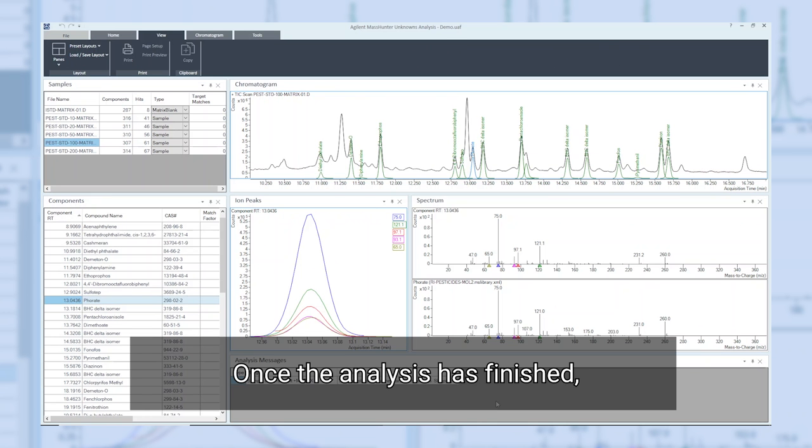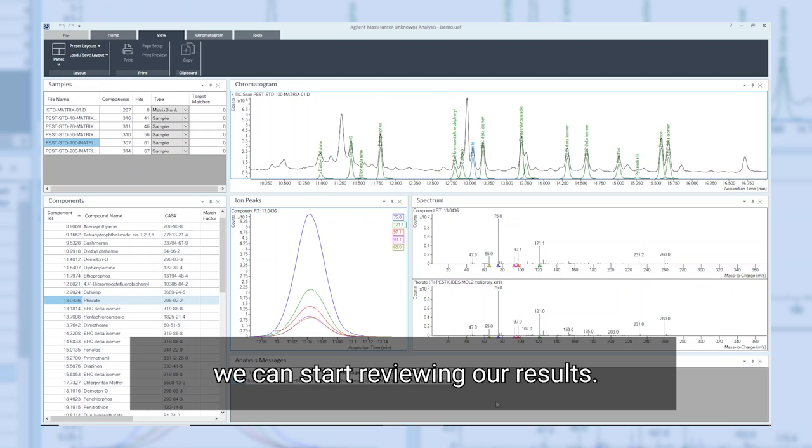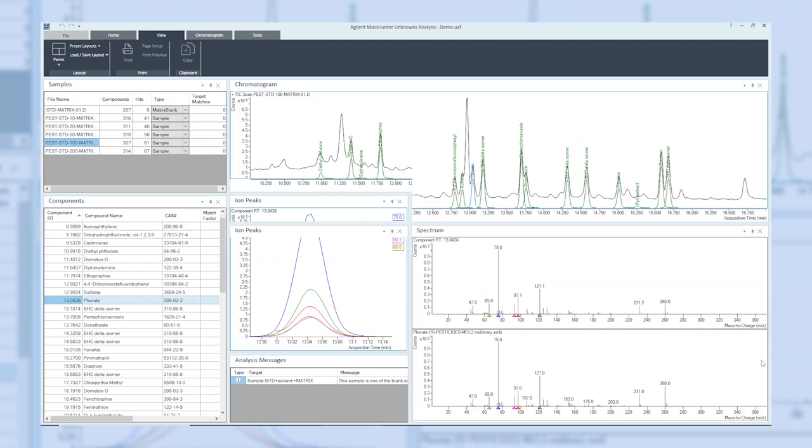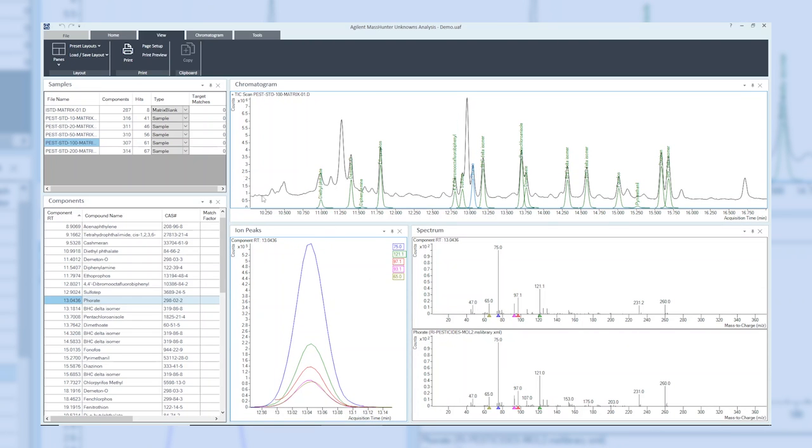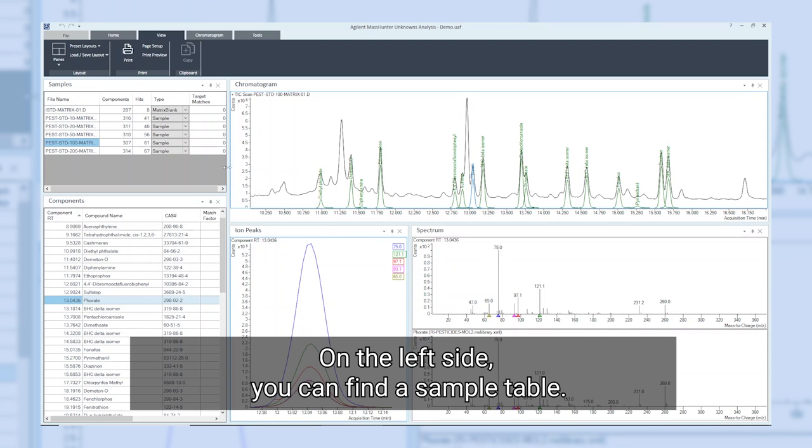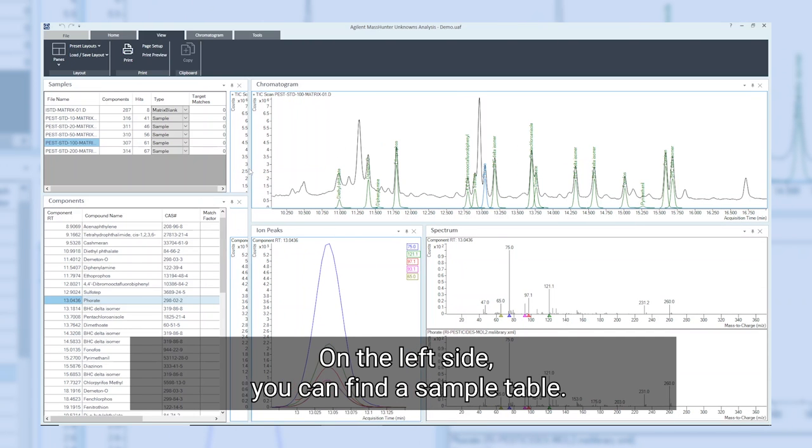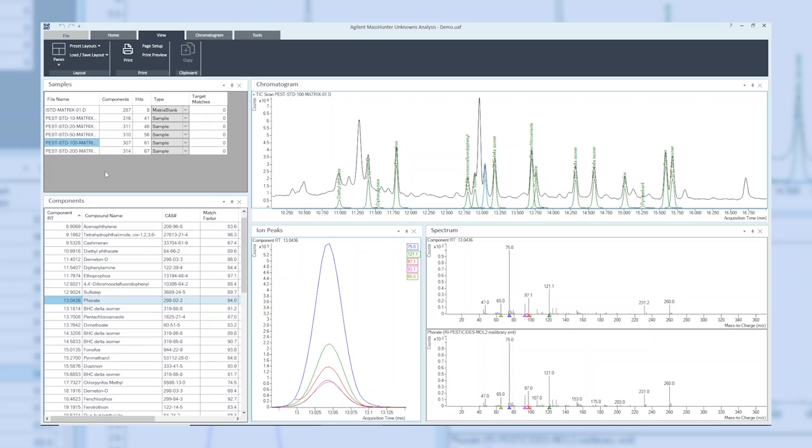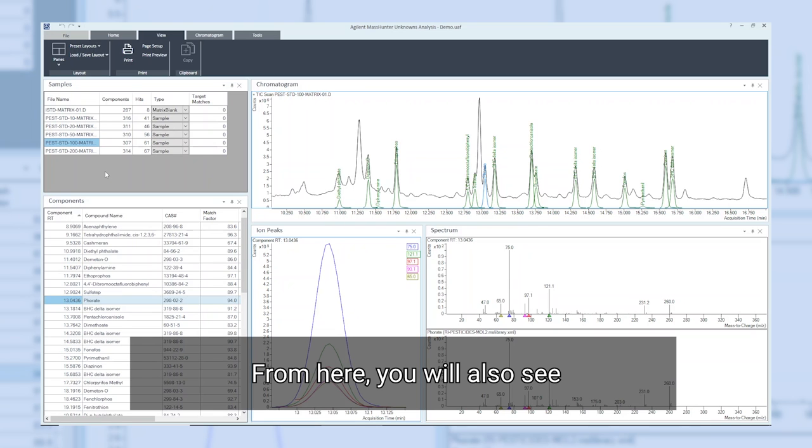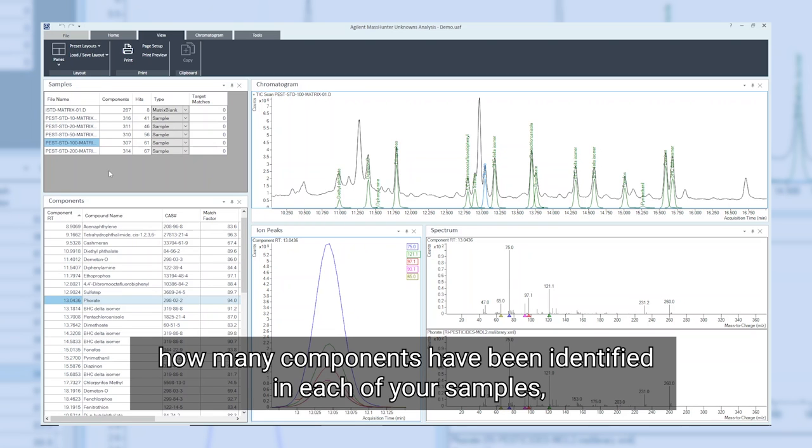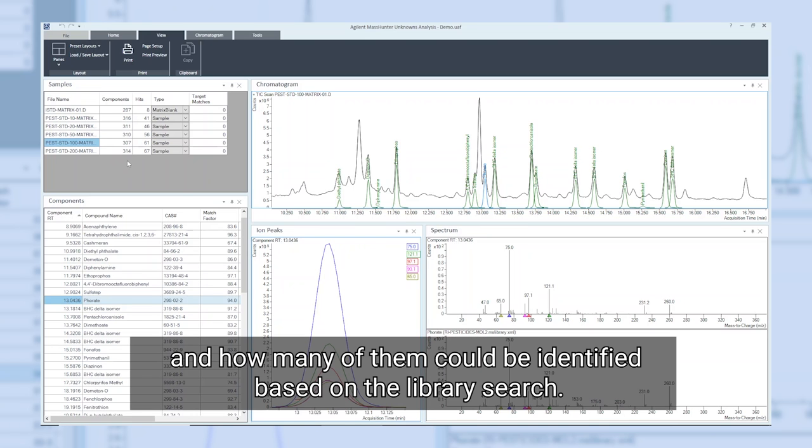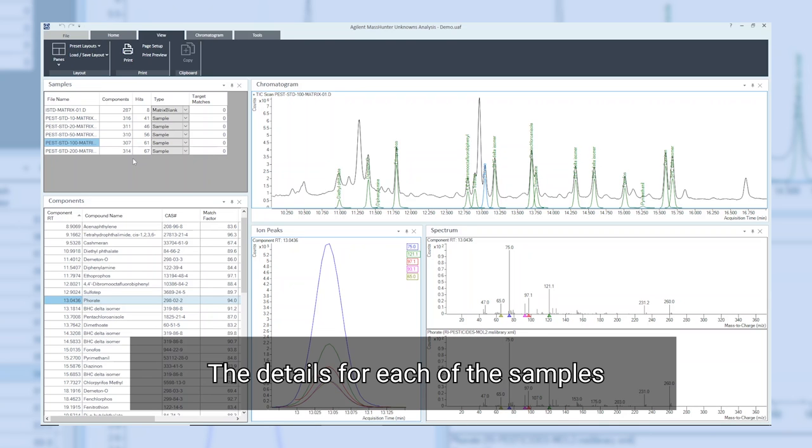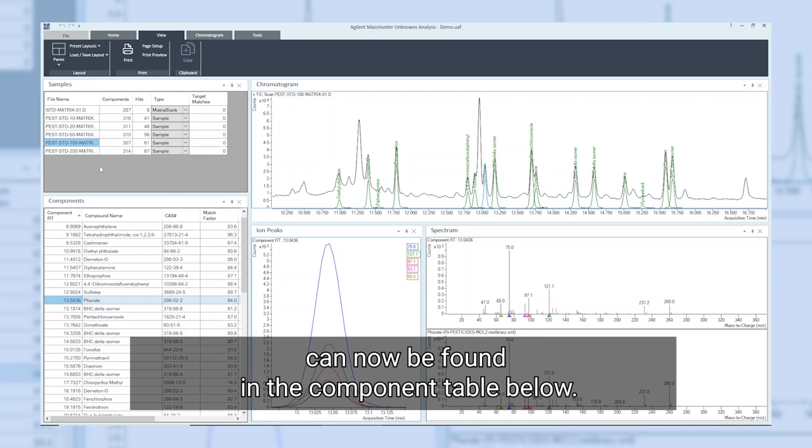Once the analysis has finished, we can start reviewing our results. On the left side, you can find a sample table. From here you will also see how many components have been identified in each of your samples and how many of them could be identified based on the library search.